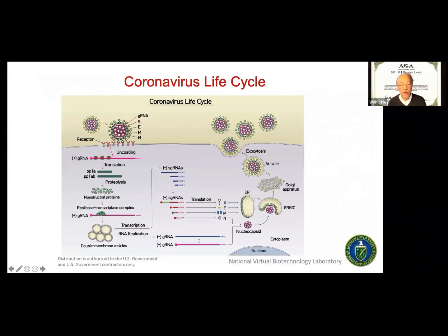I'd like to move to the third example. During the pandemic last year, we were all locked down. So I decided we would use cryo-EM to look at different components of the coronavirus. This is what the cartoon said in the newspaper. It's a sphere with some density sticking out, some spikes sticking out.